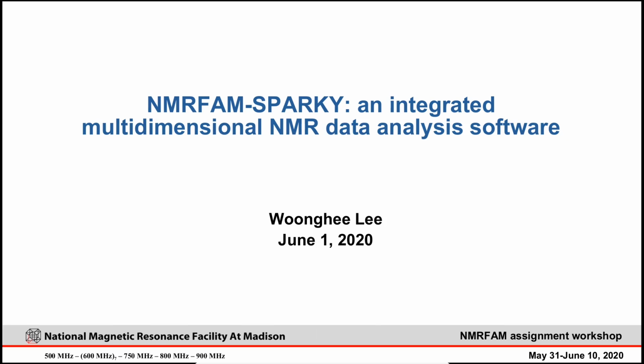Hi, my name is Ung-hee Lee, and in this lecture, I'm going to talk about NMRFAM Sparky, which is an integrated multi-dimensional NMR data analysis software that you will use in the remaining lectures in this workshop most of the time.